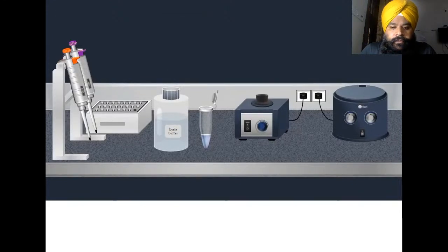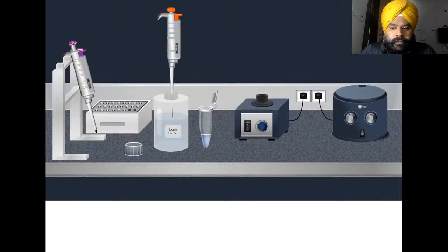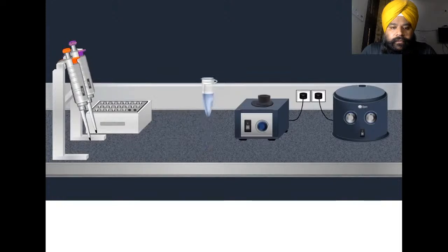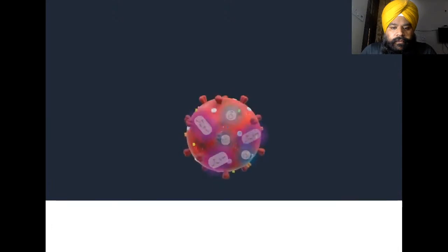This buffer is highly denaturing, and usually consists of phenol and guanidine isothiocyanate. Also, RNase inhibitors are usually present in the lysis buffer to ensure isolation of intact viral RNA. Once the lysis buffer is added, the tube is mixed by pulse vortexing and incubated at room temperature. Then the virus is lysed under the highly denaturing conditions provided by the lysis buffer.